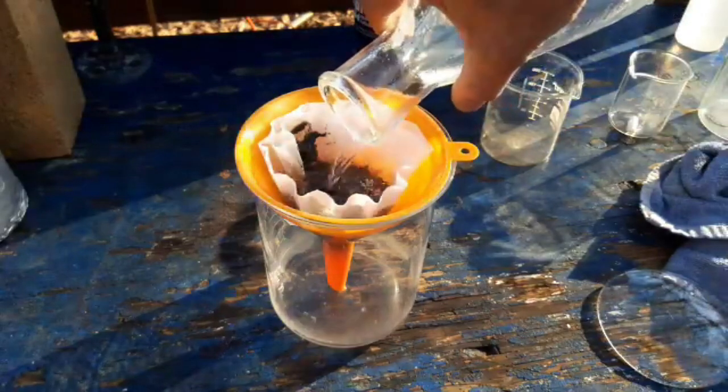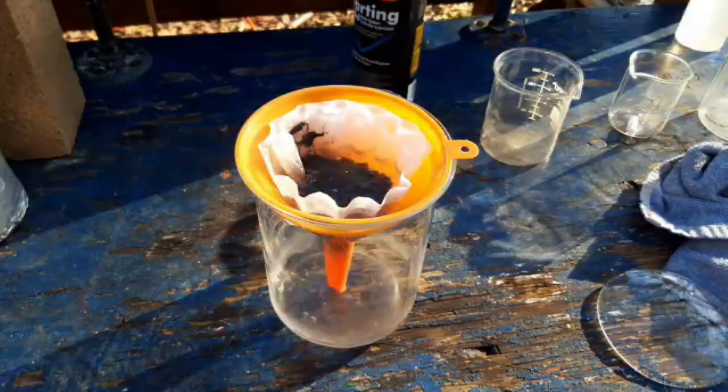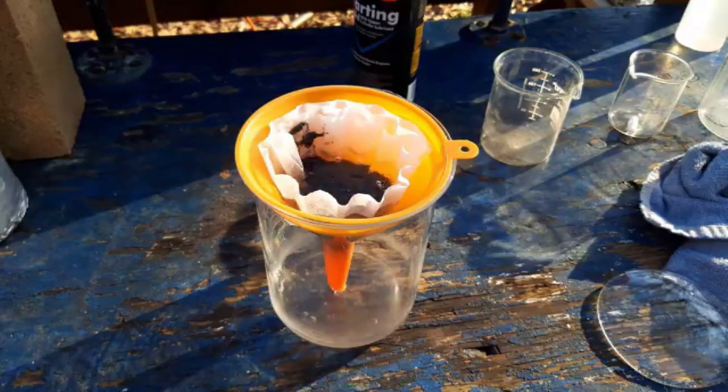Here we go — filter! It seems kind of porous. Is that good?